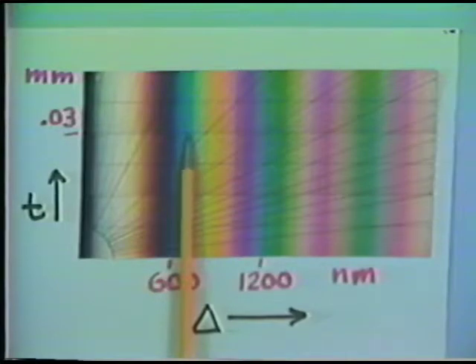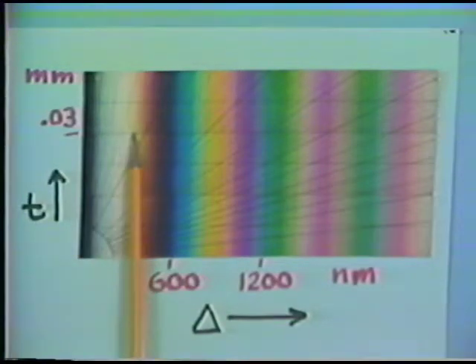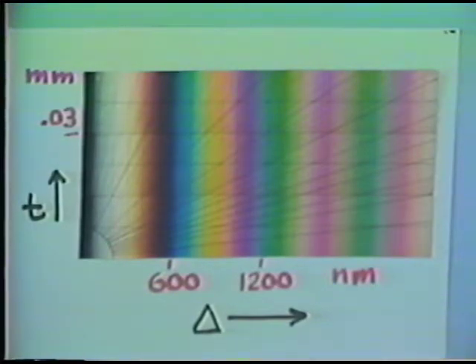For the grains which have actually opposed the gypsum plate, there is a subtraction, and we subtract out the 150 nanometers, but the gypsum plate imposes an even larger retardation, which moves us back up the interference color to this yellow. So we see either a yellow color or a blue color depending on whether the retardation is enhanced by the accessory plate or whether it's working opposite to the accessory plate.